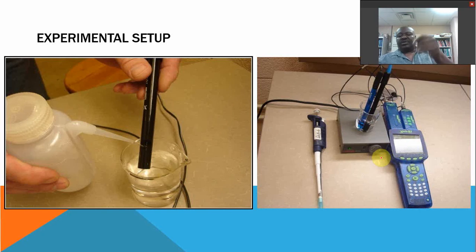Now, very important, especially for the conductivity sensor, because the sensors are embedded: when you add an aliquot, you stir, then you move the conductivity sensor up and down so that the solution within the measurement area is the correct one. Other than that, add, stir, measure. You can do the 10 or so measurements of the two sensors in a few minutes. In 10 to 15 minutes, you're done with one reagent.